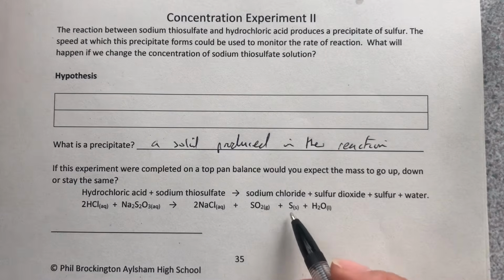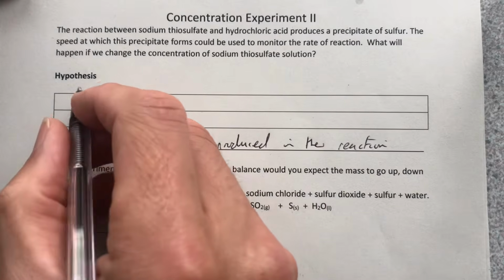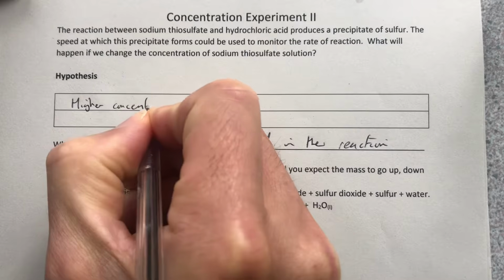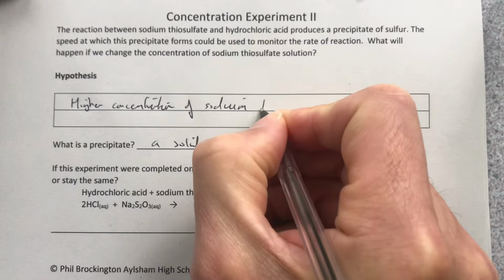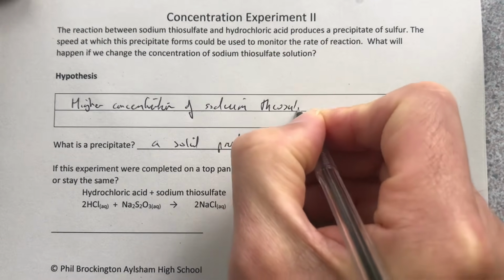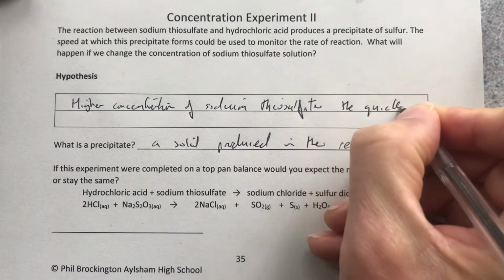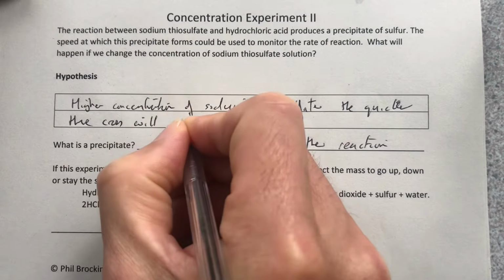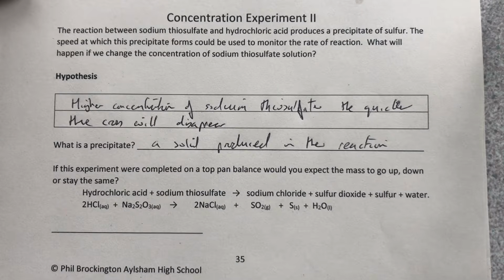Quickly, a hypothesis, because we're changing the concentration of the thiosulfate. The higher the concentration of sodium thiosulfate, the quicker the cross will disappear, because the quicker the sulfur will be produced, because the quicker the reaction will go, and that's obviously because of particle theory. We'll possibly talk more about that later.